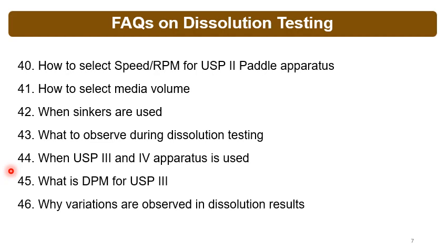Why are variations observed in the dissolution results? There are a lot of reasons for variations. That may be from the formulation point of view, that may be from the dissolution apparatus point of view, or from the analytical point of view. So there are various reasons.